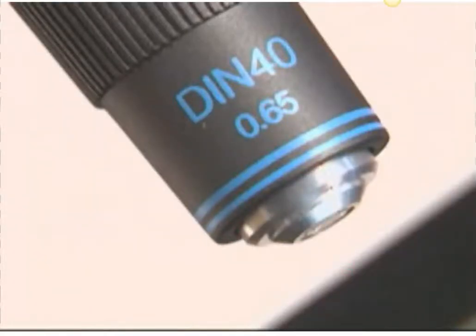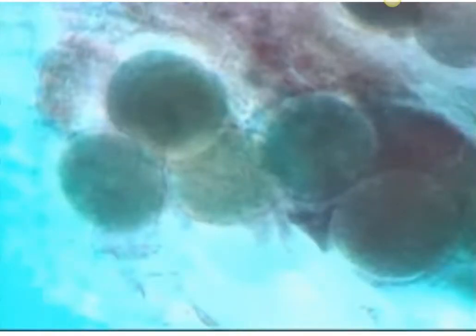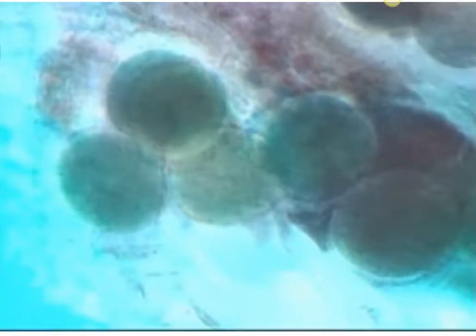When you combine a 10-power eyepiece with a 40-power objective, the overall magnification becomes 400. These are the brine shrimp's eggs magnified 400 times. Each magnification teaches us something new and different about a specimen. The microscopic world is waiting for you to explore.